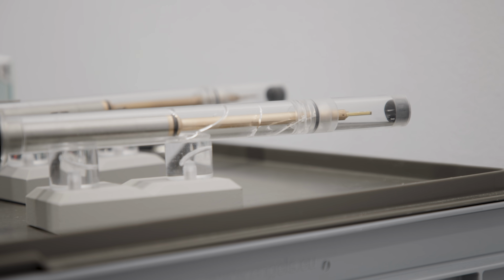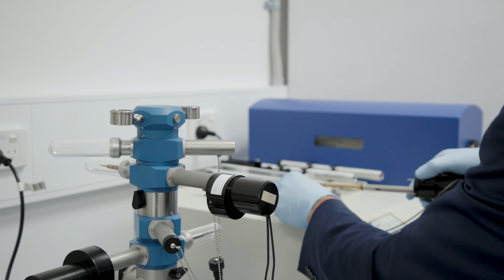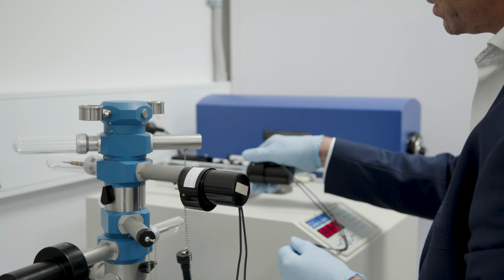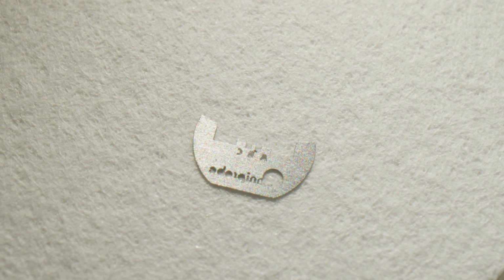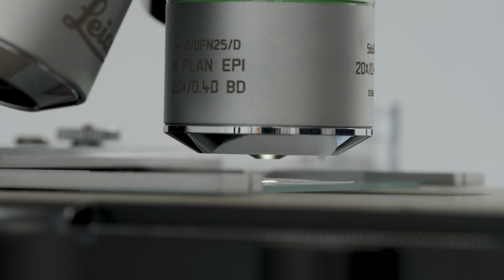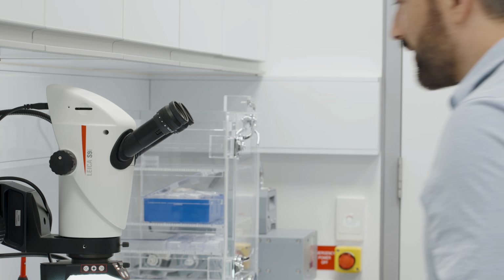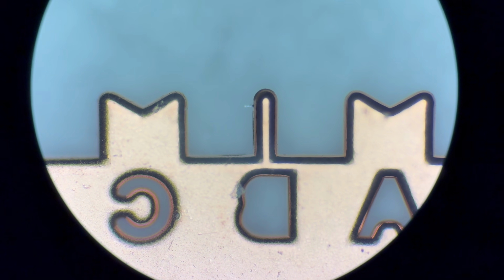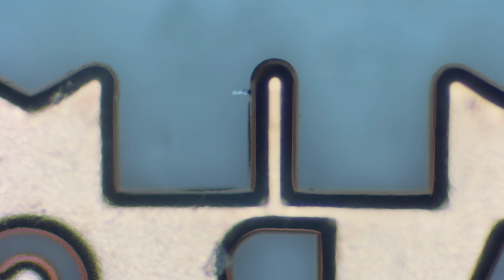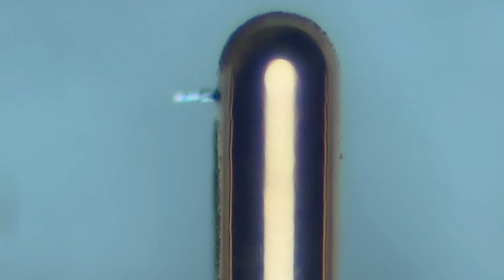So we're gonna get a sample holder. Yes, now we get a sample holder out. We put that under the optical microscope. So the sample itself is a small lamella that you can't see without the optical microscope. Yeah, have a look through that. Beautiful. On top of the B, there's a prong. Yeah. And on the very top of that, on the left-hand side, looks like a little bit of dust. That's our actual sample.